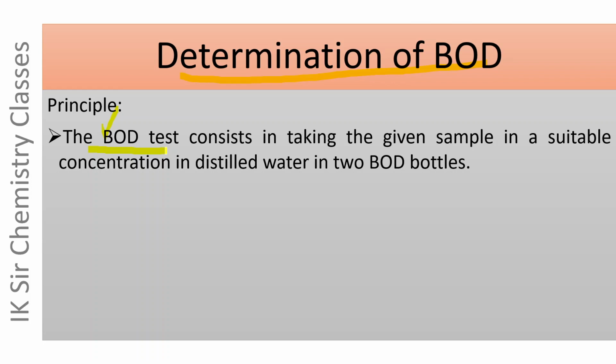The evaluation of BOD value of a water sample consists in taking the given sample in a suitable concentration in distilled water in 2 BOD bottles.